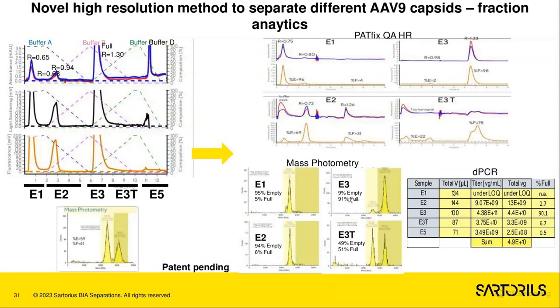If you calculate this with fluorescent detector with HPLC, we would even see 98%. The PCR also shows us more than 90% recovery. There are some genes still in the tailing, but the tailing, if you put it here, we see that we have quite a mixture of fulls and empties, so we need to be a bit careful with this tailing. I would not use it because we still need to do some further analytics to better understand what was going on.